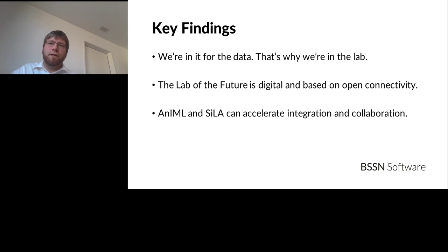The third point, AnIML and SiLA, we've seen that they work together very well, and they can accelerate these types of integrations and the collaboration between those different pieces.